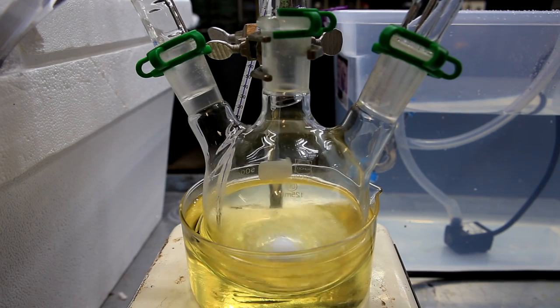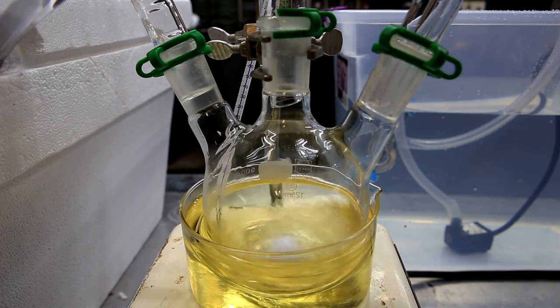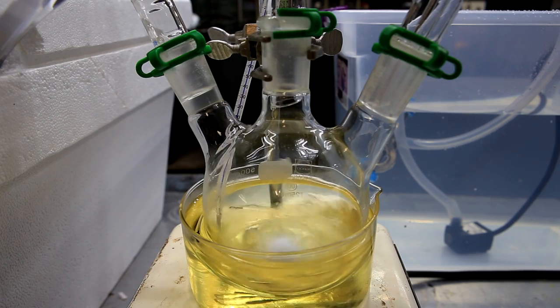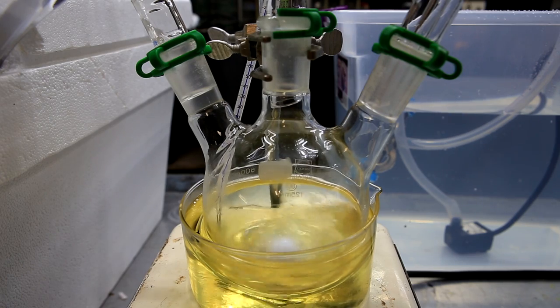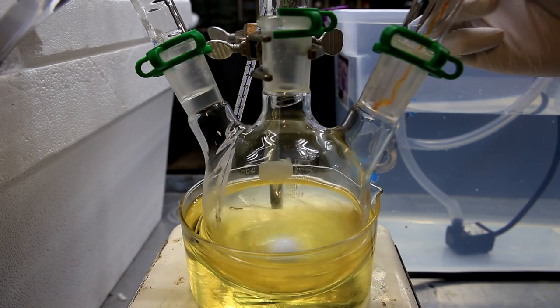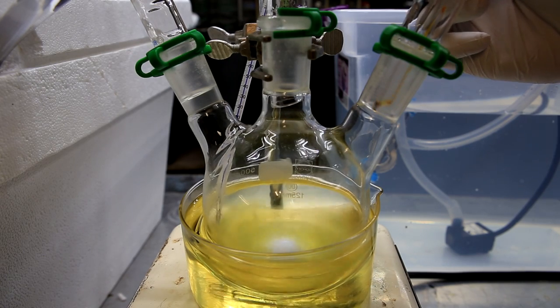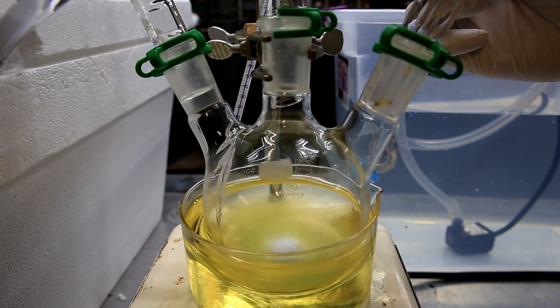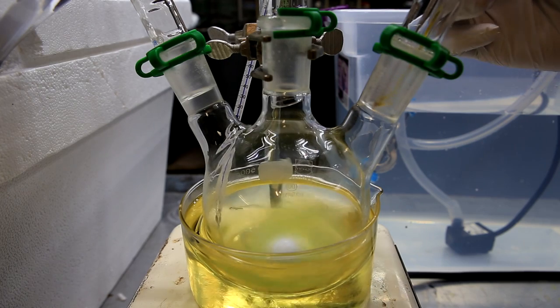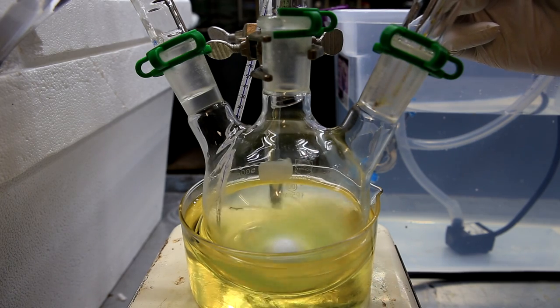To start off, we bring it to reflux and we can see that the n-propanol is refluxing back into the reaction flask. Once the reaction is boiling vigorously, we can dropwise add some of the chromic acid solution. You can see that immediately upon addition, it turns a green color.